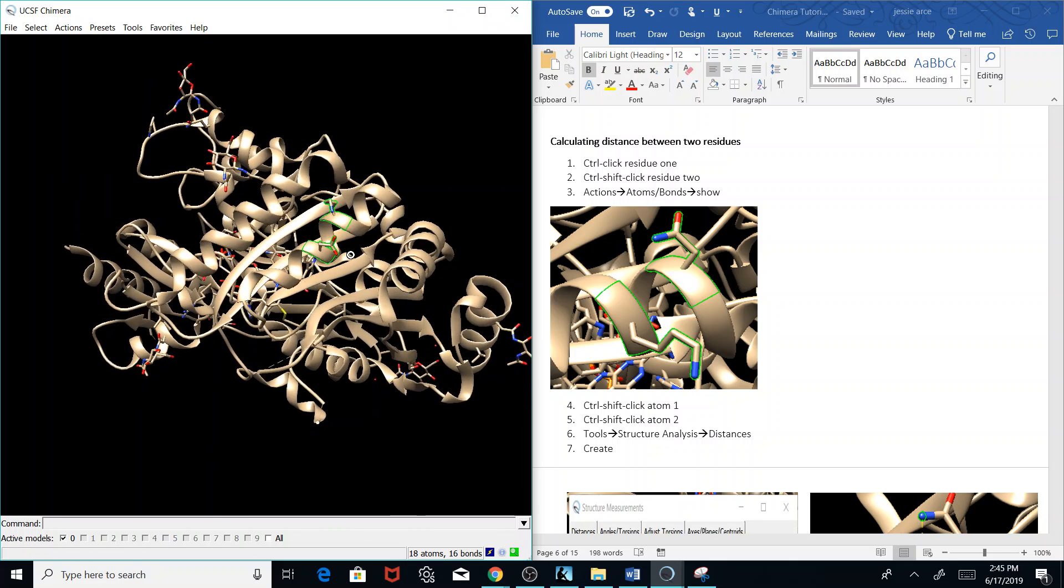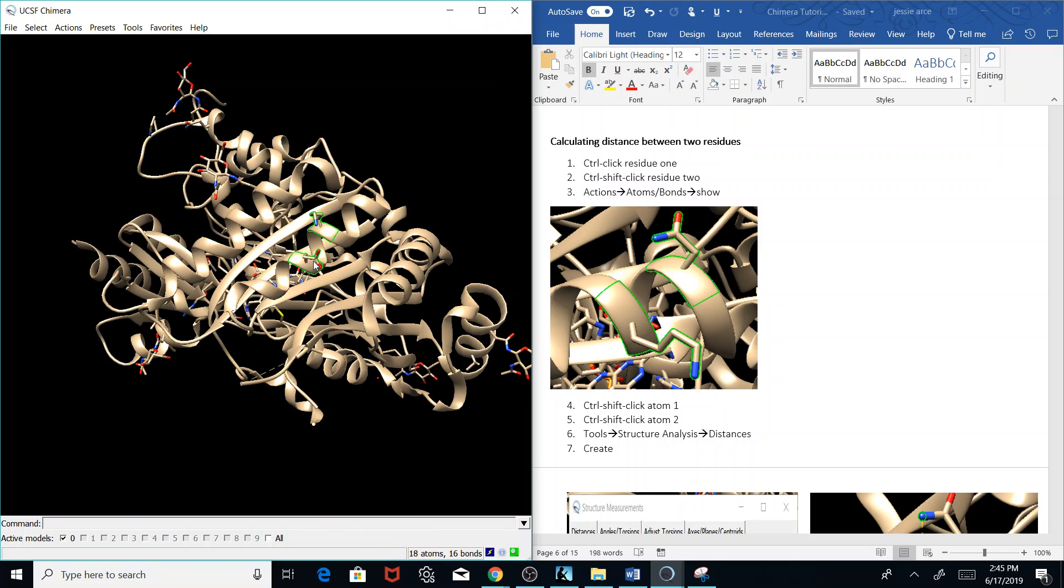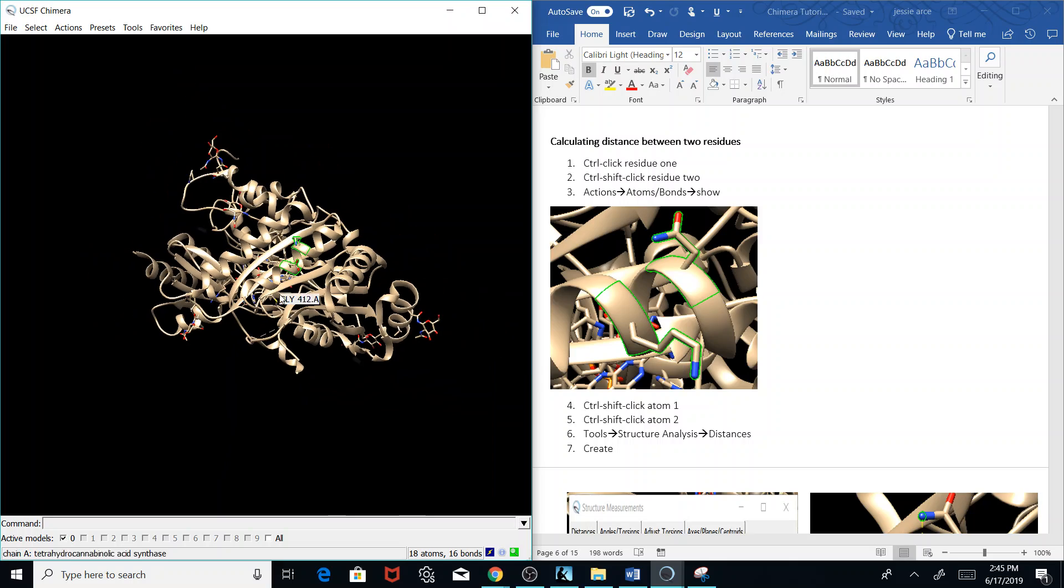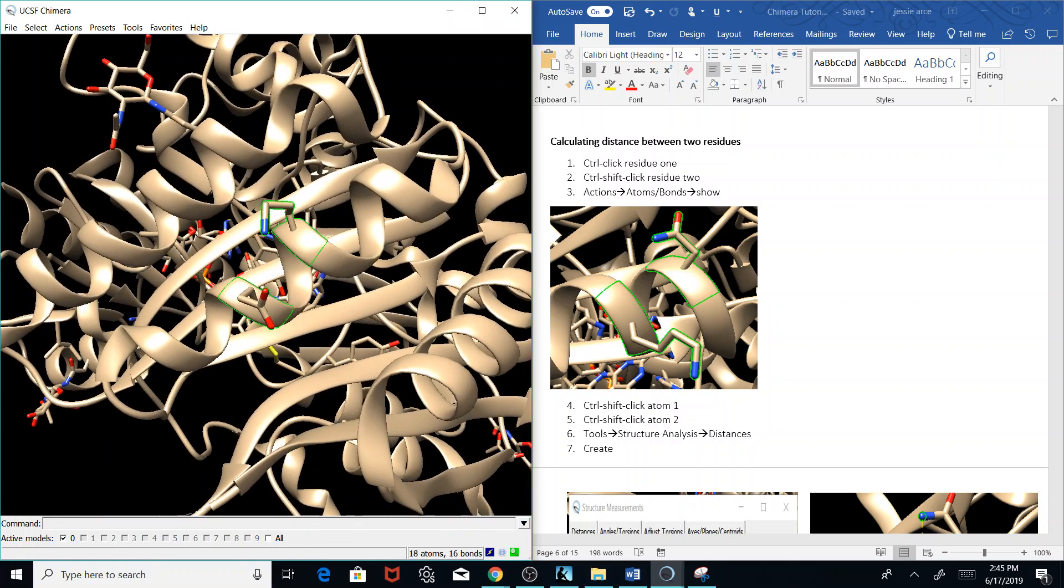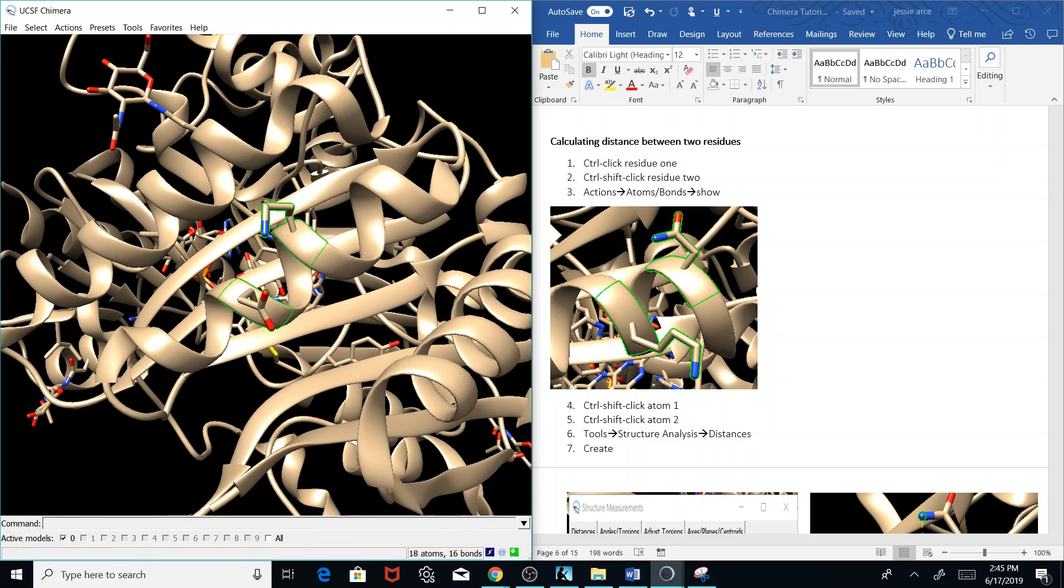Now I'm going to click the atoms that I want to measure. So I'm going to unselect these residues here.